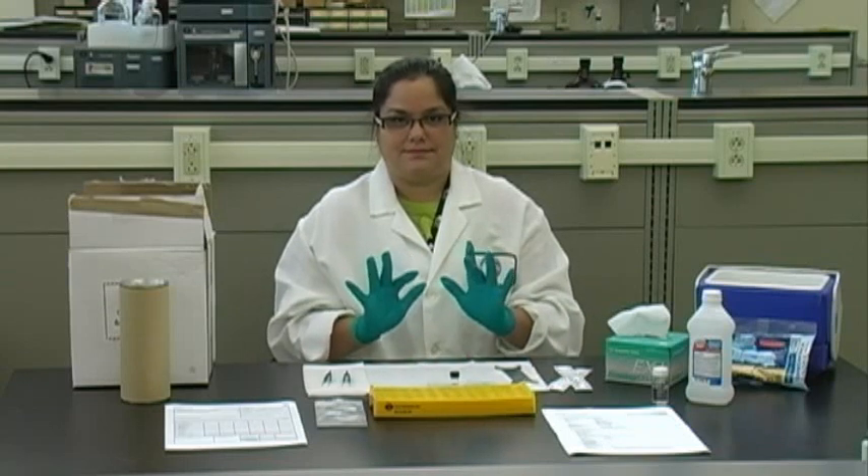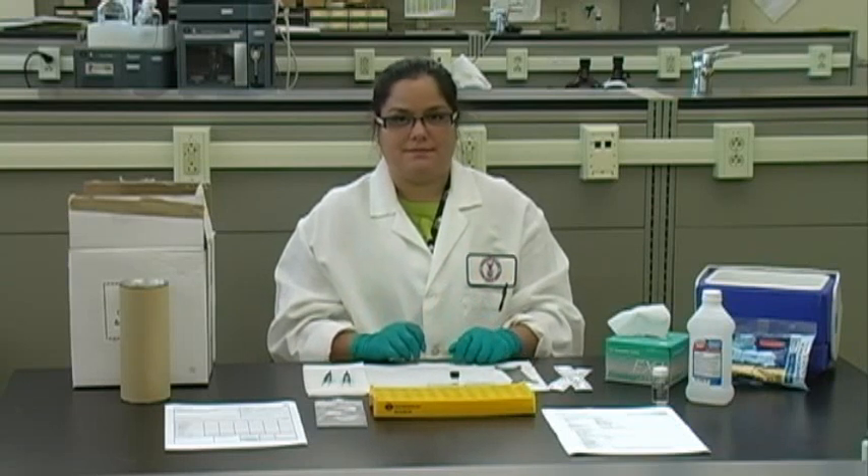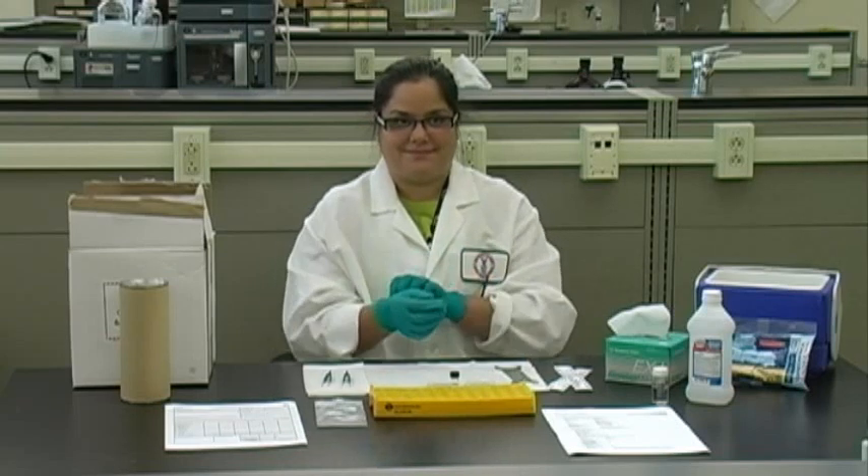Wear nitrile gloves when handling the coated filters and the extraction solvent. Nitrile gloves have excellent resistance to dimethyl sulfoxide but only fair resistance to acetonitrile. So if you do accidentally spill solvent on them, remove and replace the gloves immediately.